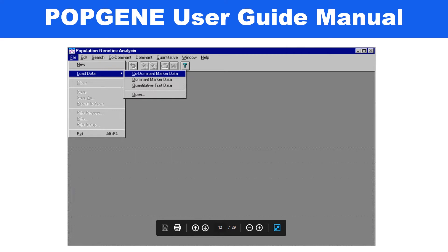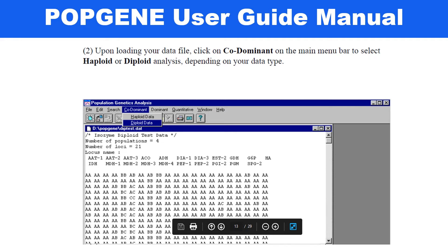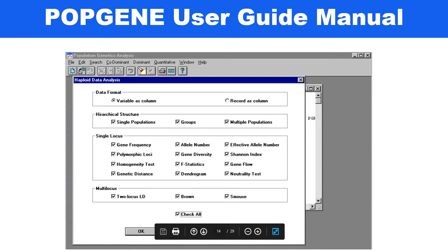This is the window of your Popgene software — once you install it, you will get this first window. Load your data and click on data, selecting which type you want to load — dominant or co-dominant. Upon loading your data file, click on the co-dominant main menu bar to select haploid or diploid data types. These are the analysis parameters you can select; if you don't know what analysis you want, just check all.